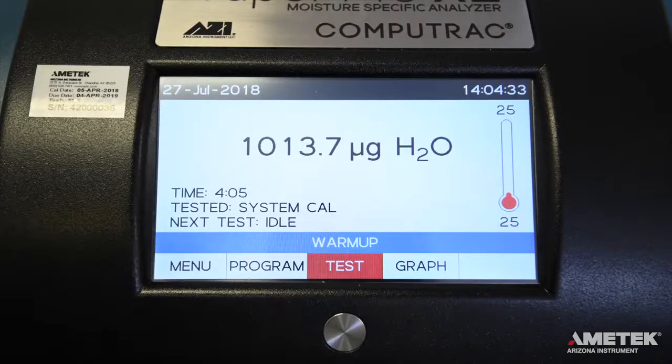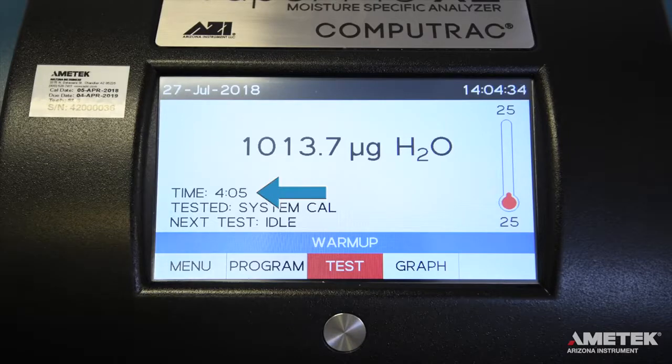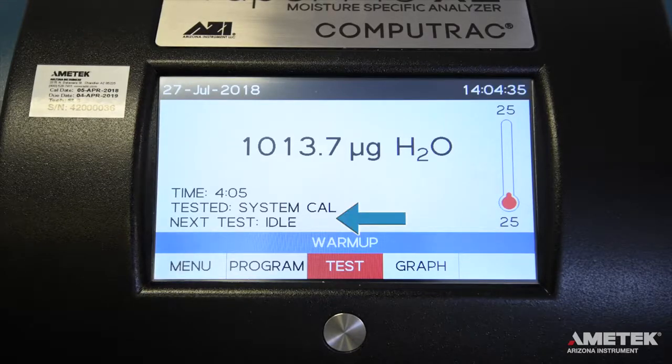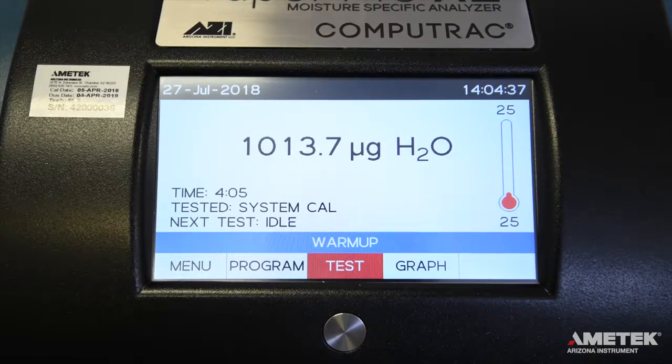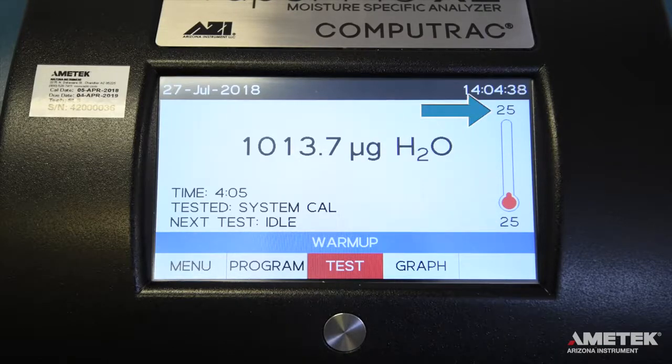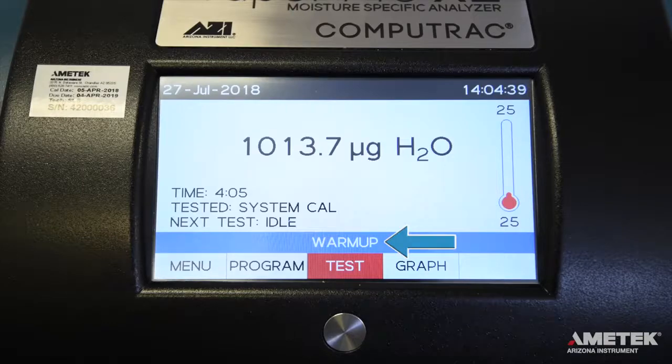The main screen displays the length and result of the last test, the previous and next test program, the current oven temperature, the test temperature for the next test, and the current system status.